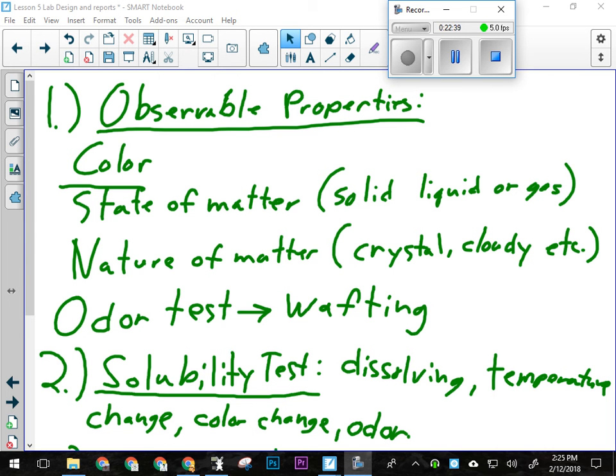Not too full, because when I perform my conductivity test, I've got to be able to put this tester in there and not have it spill out and overflow. So I would say in performing the solubility test, add water until it's 3/4 of the way full. Now, when you're doing the solubility test, understand you have a very small amount of water in here. Are you going to get even a small amount of unknown to dissolve, even if it's highly soluble?